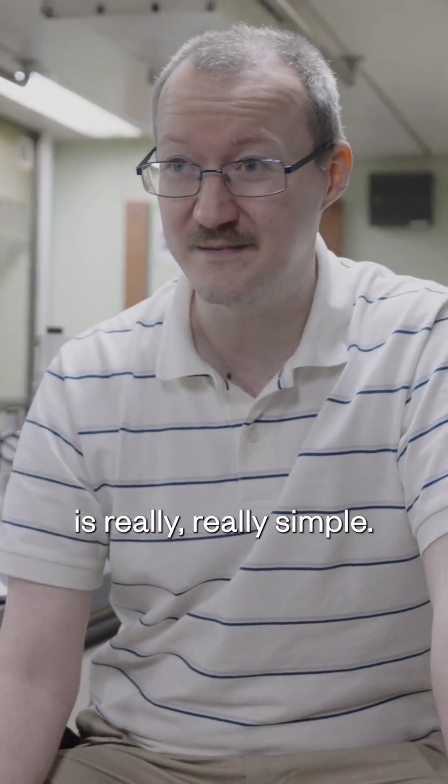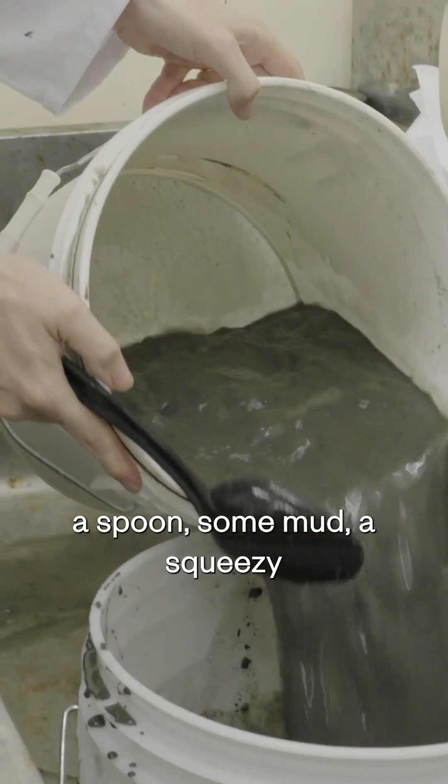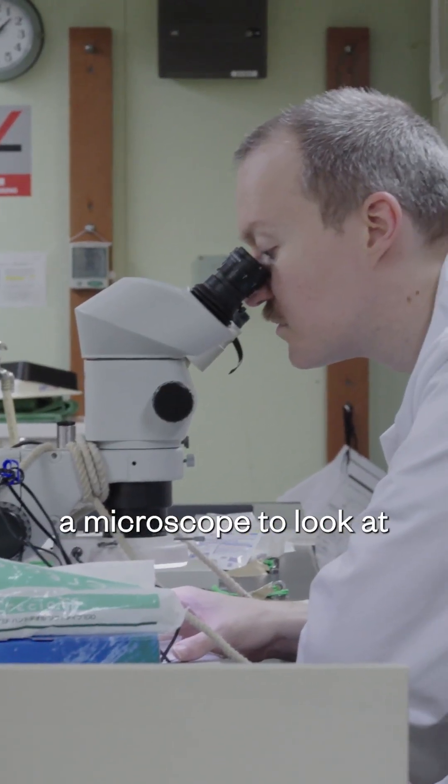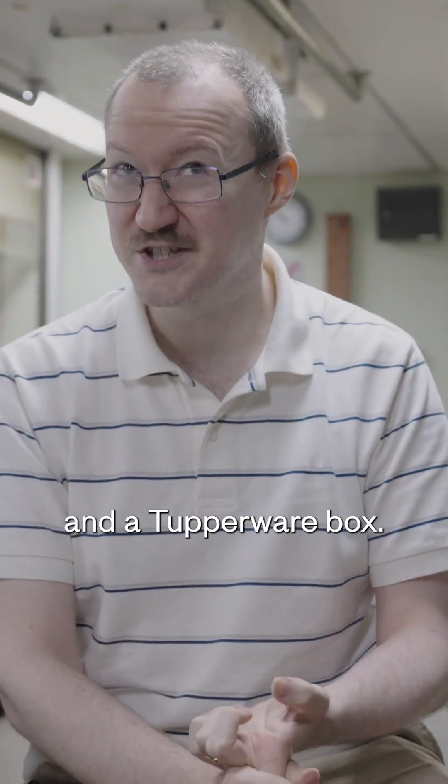Bubble and block is really simple. First, what you need are two buckets, a spoon, some mud, a squeezy bottle of any kind, a microscope to look at, and the most important part, some printer paper and a Tupperware box.